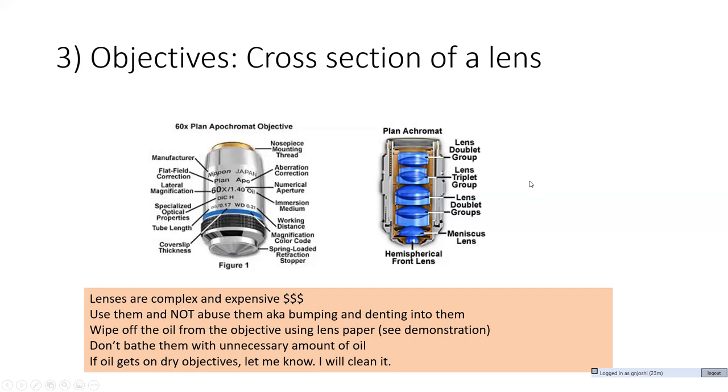Is it like I have to do it manually from the software, or you mentioned here that working distance is 0.21 for this lens. Like, how is it automatic, or do I have to manually set it up? So with regards to all the air objectives that you have on Keyence, it's all automatic. You don't have to do much. When it comes to using oil immersion lens, you have to do things manually. And I'll talk more about that. And tomorrow when you are here, I'll demonstrate what that really means.